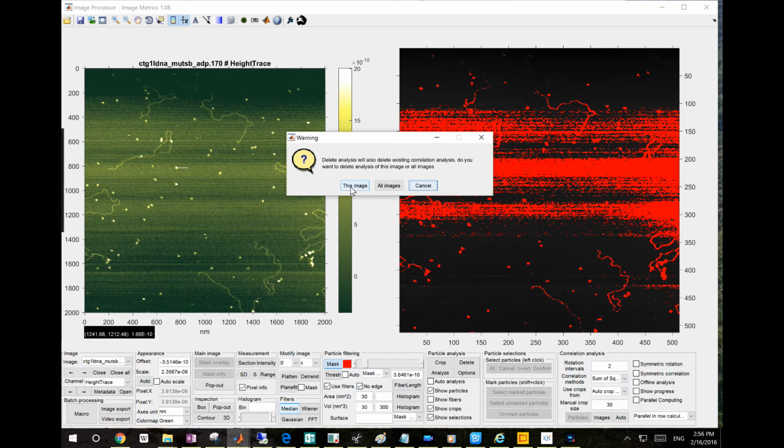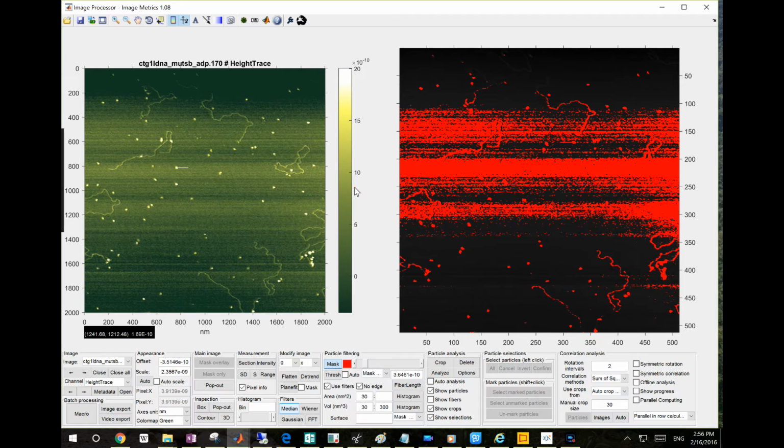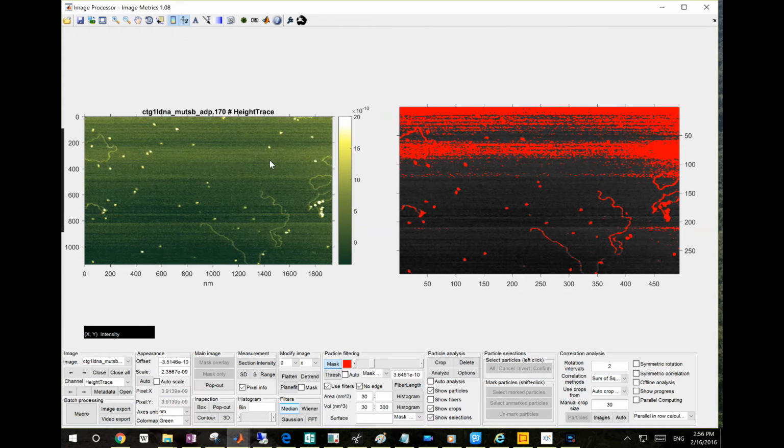I'm not sure whether they are the same size or not right now, so I just crop this one image. Just click this image. So basically you only analyze the image I cropped, only this specific area of the image.